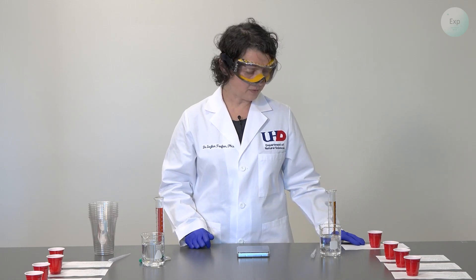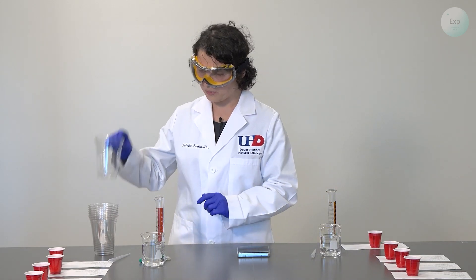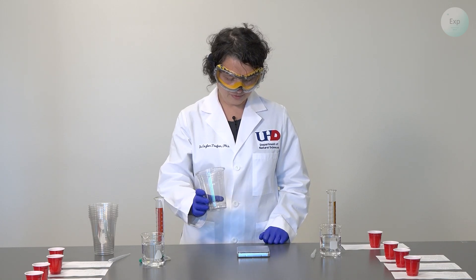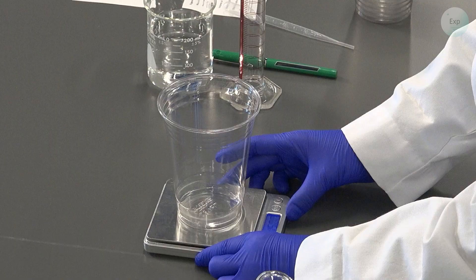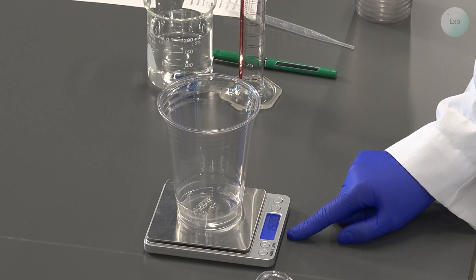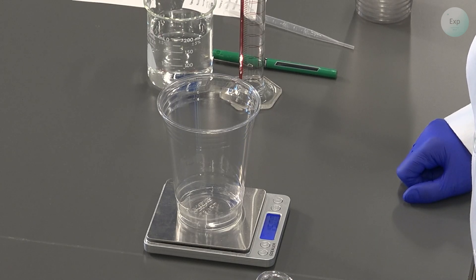I'm going to begin with experiment one. Experiment one will require a cup. I will take my cup, place it on the scale, and record the mass of the cup. In this case, it is exactly 15.00 grams.